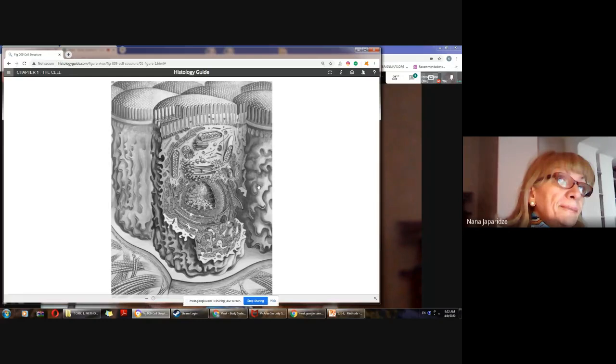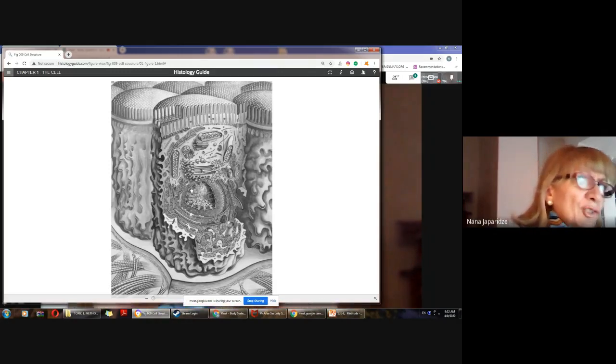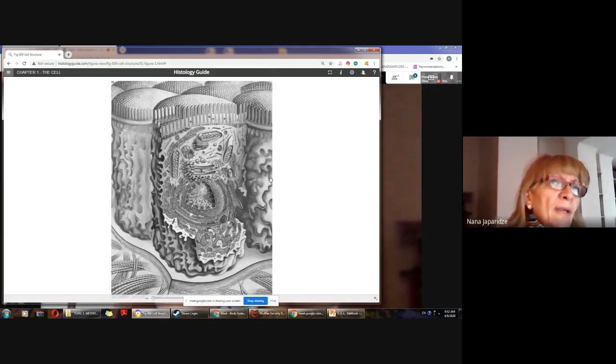So here I received the question, will this lecture be uploaded on the portal or not? You know, this is actually not a lecture. This is a tutorial. And you can use this web page, I mean, histology guide, and it will be very good if you search this web page and see these different types of images.